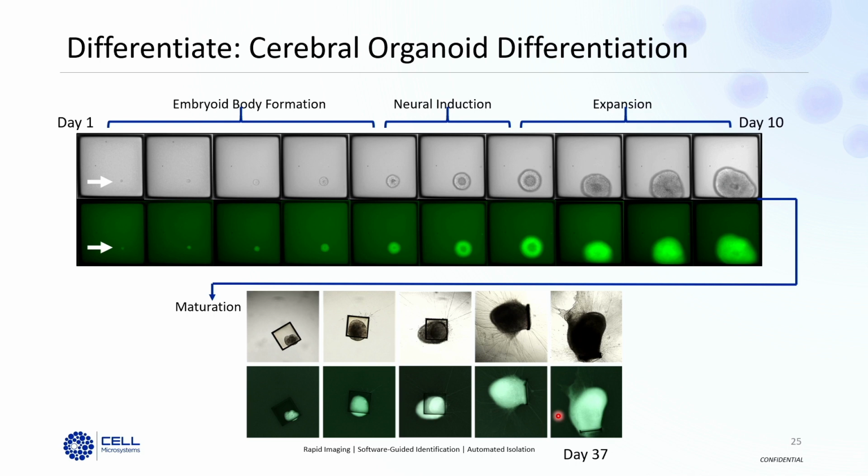There are, yes, multiple strategies, some of which include seeding the cells onto a semi-solid medium, letting them grow to a visible colony, which is then physically disrupted or scraped off. That's one way to do it. It's like any method; it has its limitations and its drawbacks. So ultimately, I think the take-home message, with respect to colony isolation, is that this is the least disruptive way to do it, but also because of the statistical nature of our array, it's orders of magnitude higher efficiency, and because we're isolating a colony, not a single cell in a well, the post-isolation outgrowth efficiency compounds upon that.